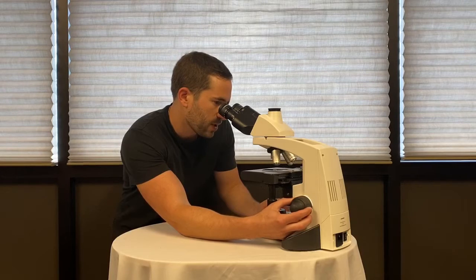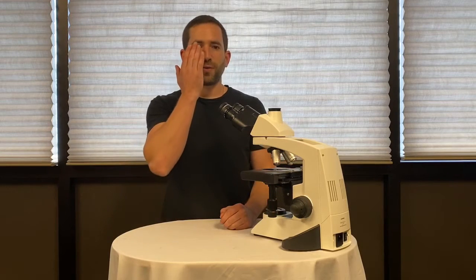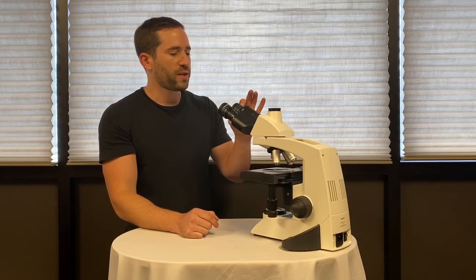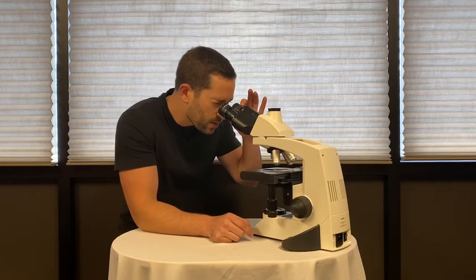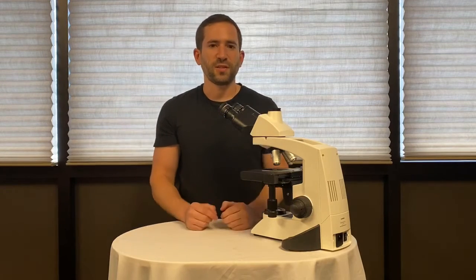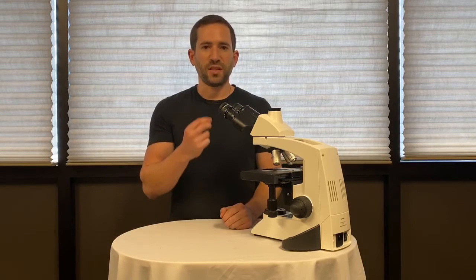Focus on my low power until the image is in focus in my right eye. Once I've done so, I will then close my right eye and look through the microscope with my left eye, and only adjust the eyepiece to get your image into focus. Once you've done this, you've set the microscope eyepieces to compensate for the differences in your eyeballs.